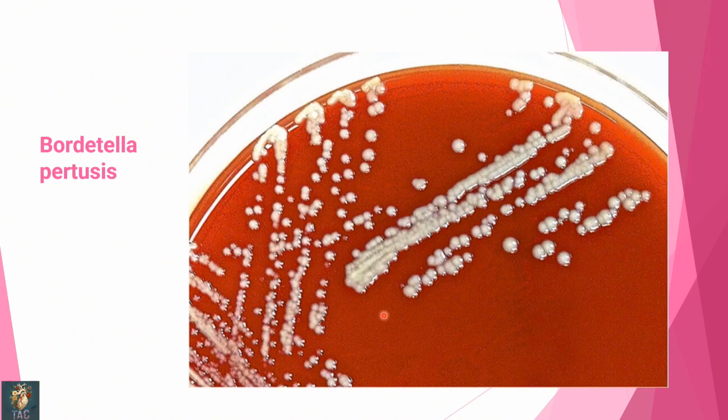Another beautiful slide of a microorganism, Bordetella pertussis, having its colonies on blood agar. Colonies are grey-white in color, smooth, mucoid. Some of the colonies are coalesced with each other. So you can't skip the details of the colony. Henceforth, you can't skip diagnosis of Bordetella pertussis.